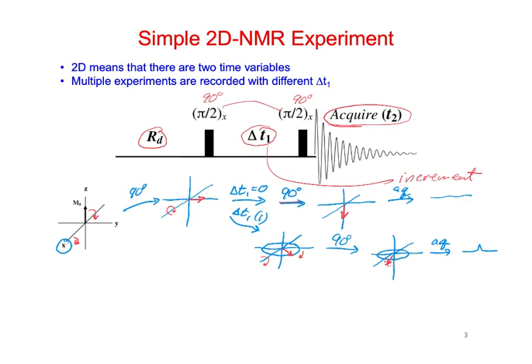All right, so we're going to do this again. 2. We're going to wait some additional time. Let's say that we wait enough time where our signal is precessed over to this x-axis. So how much is the value of delta T1 and 2, something like that?